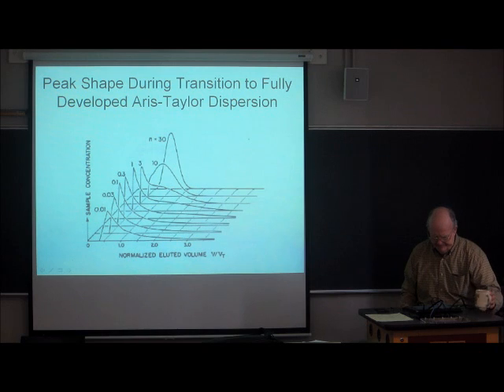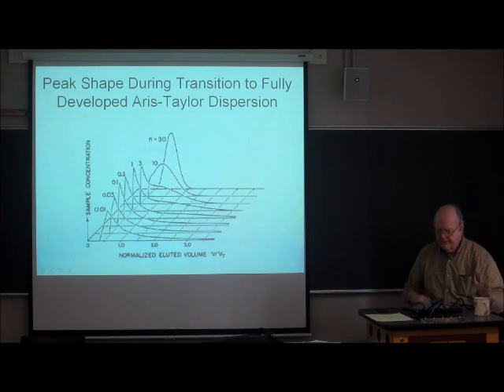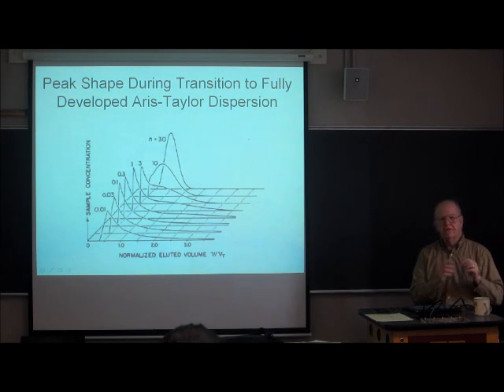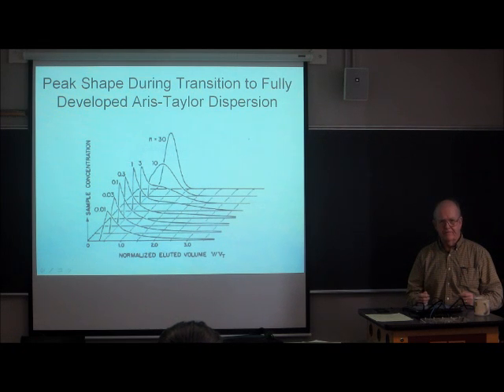Okay, now, even in an empty tube, you cannot apply the Taylor-Aris equation until the tubing has a certain minimum length.